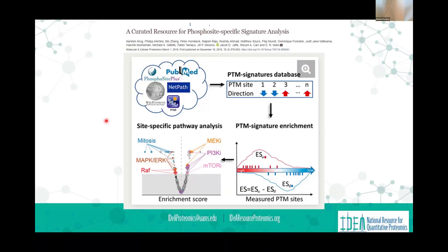And even if they were detected in the same experiment, you really can't use the intensity of both to compare, because the phosphopeptide is going to ionize at maybe 10% of the rate of the non-phosphorylated, and so that's more difficult. It's a much better comparison to compare the overall starting protein concentration, and within TMT that's easy to do.